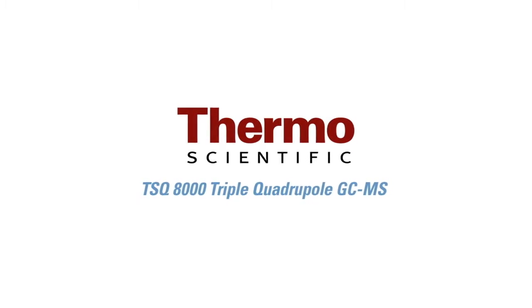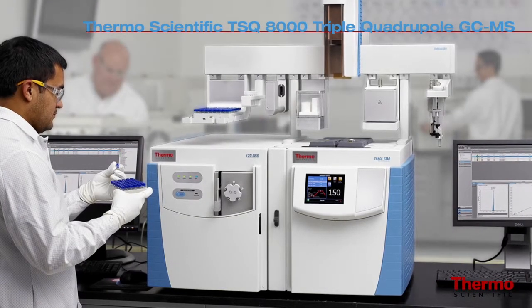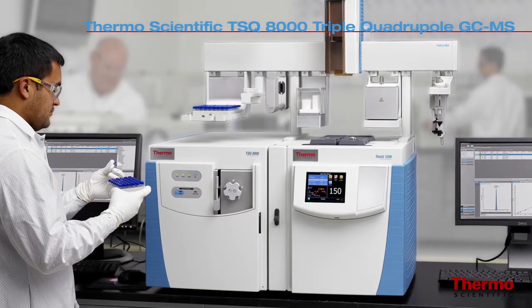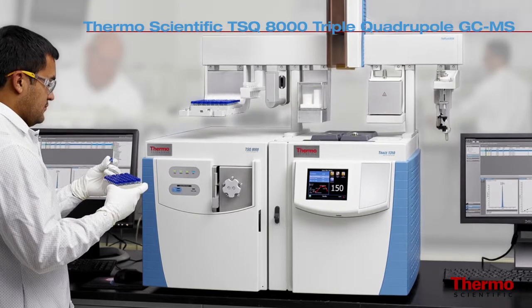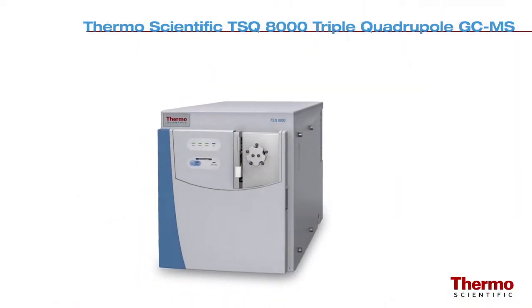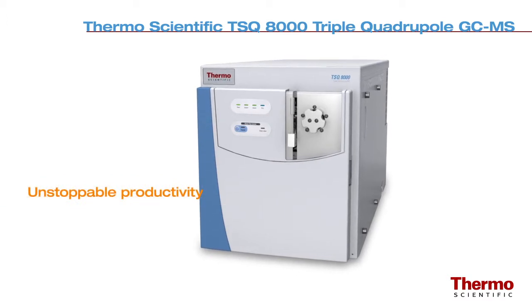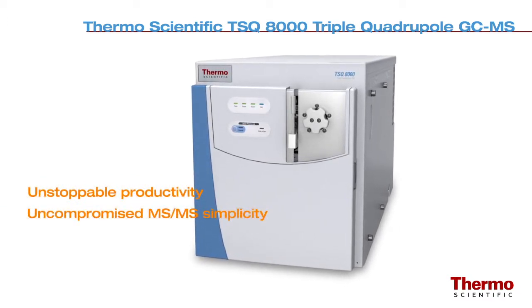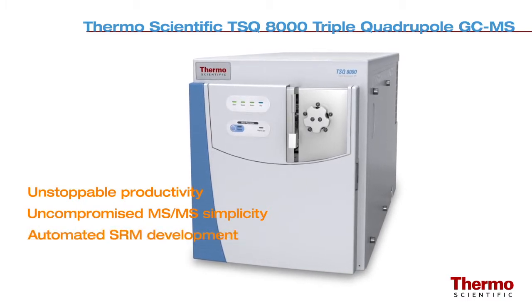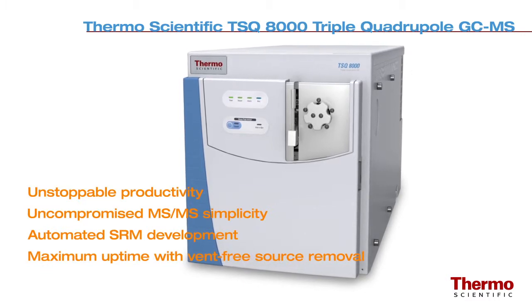The new Thermo Scientific TSQ8000 high-performance GC triple quadrupole mass spectrometer offers innovative technology that is both reliable and easy to use. The TSQ8000 GC-MS system offers unstoppable productivity for challenging matrices with uncompromised MS-MS simplicity, automated SRM development, and maximum uptime with vent-free source removal.